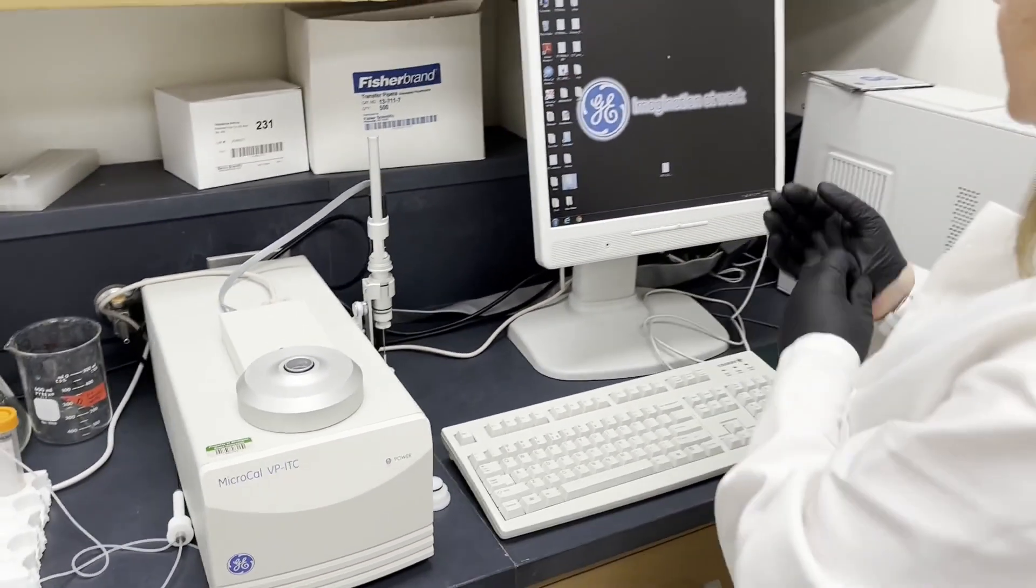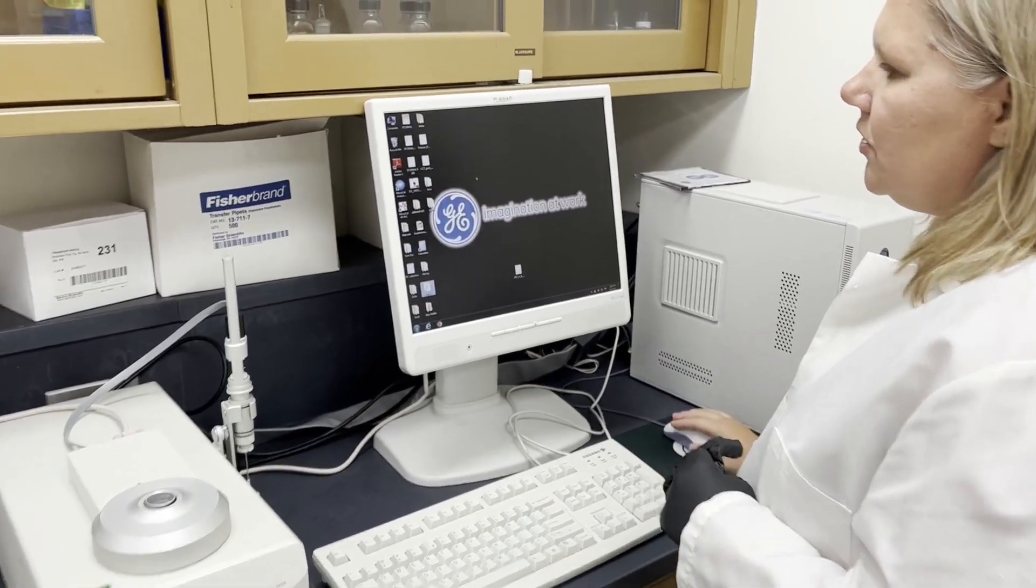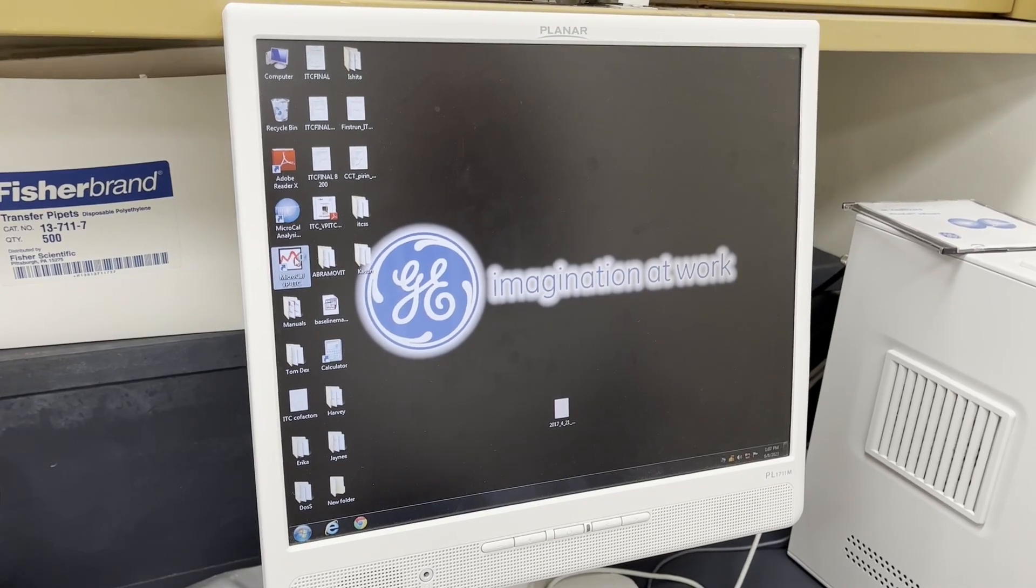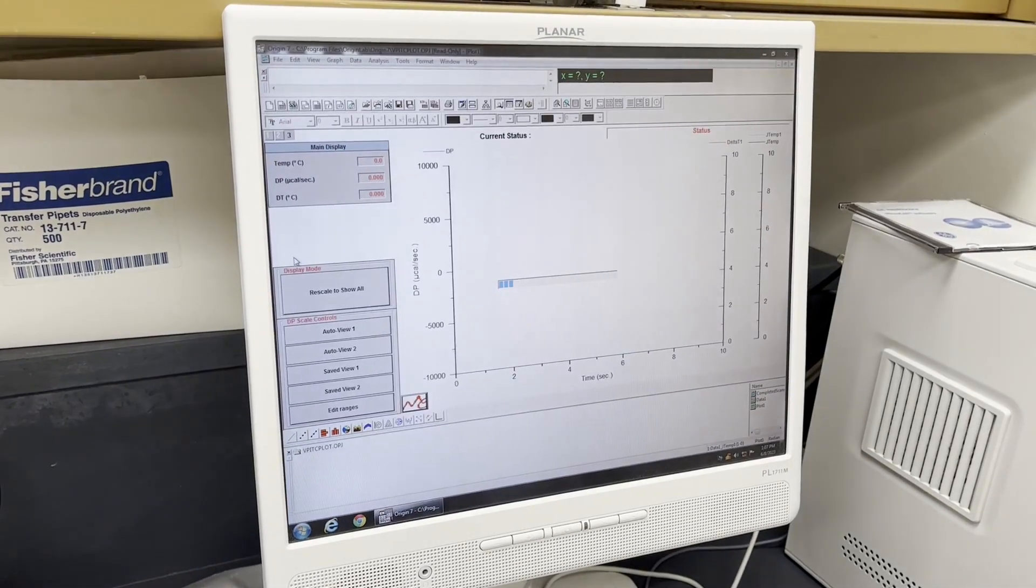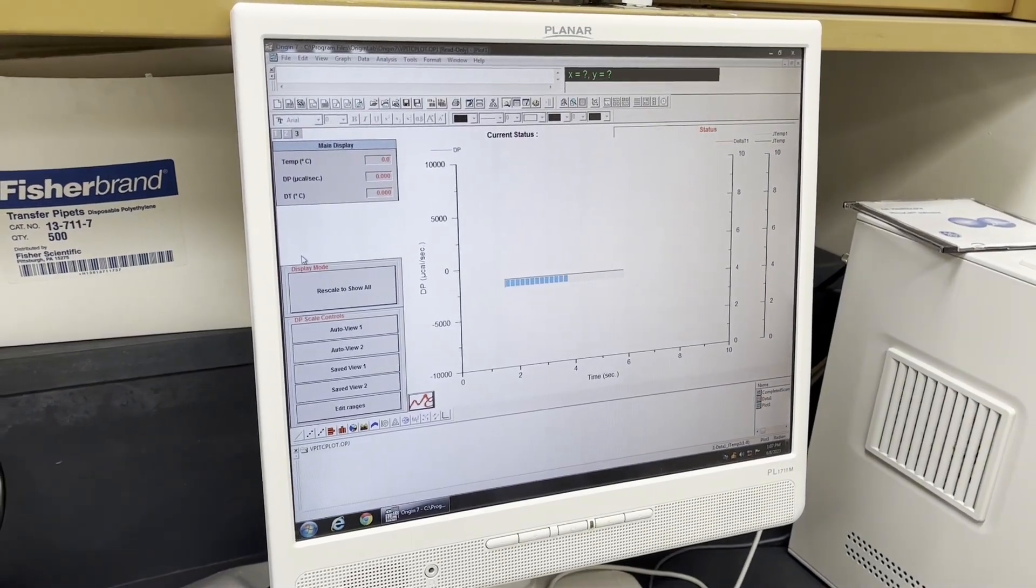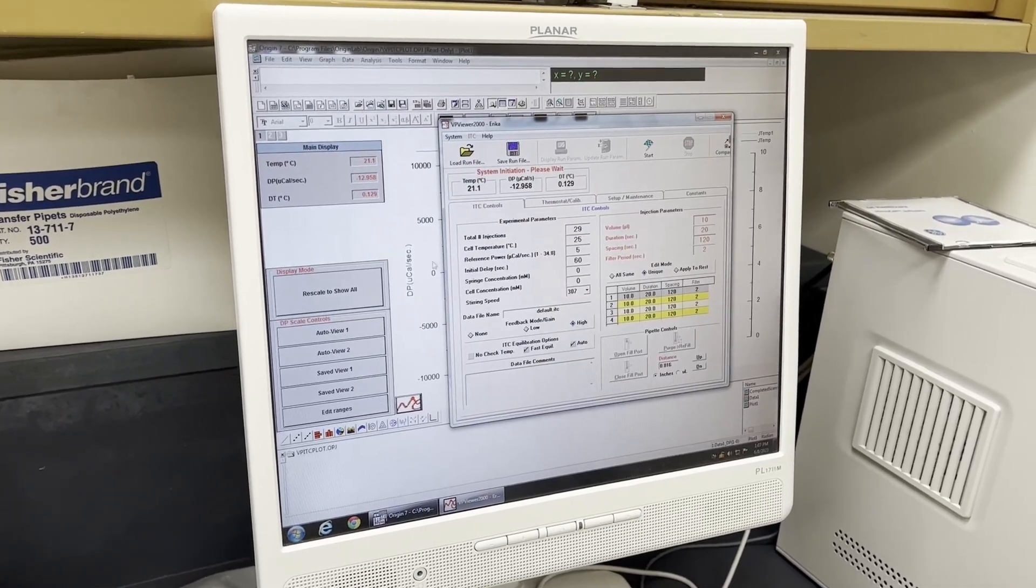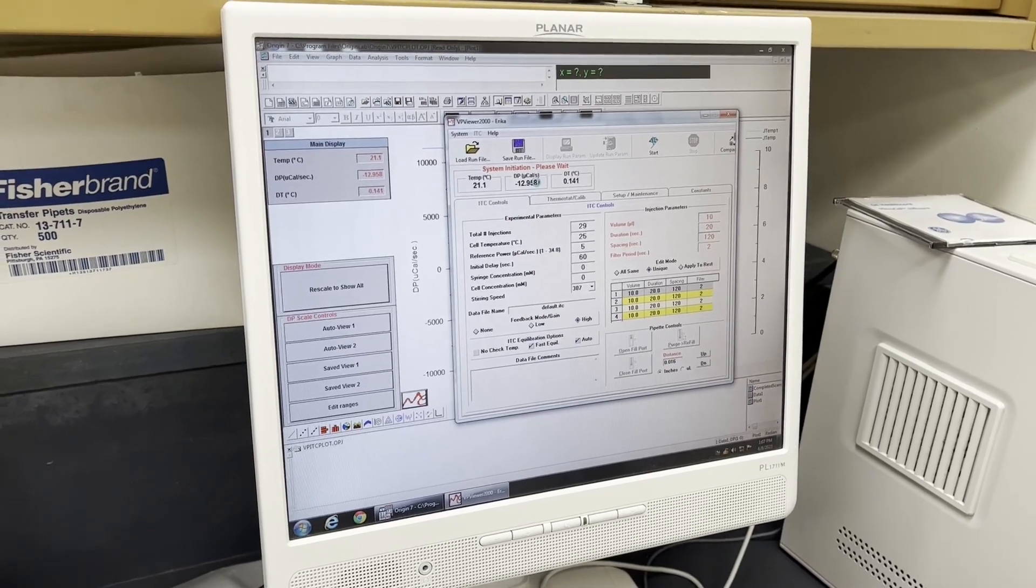I turned it on but what I also have to do is open the software. The software is the MicroCal VP ITC that runs the instrument. The analysis software is something different. So it's initializing the system right now.